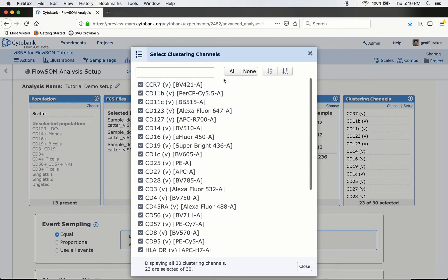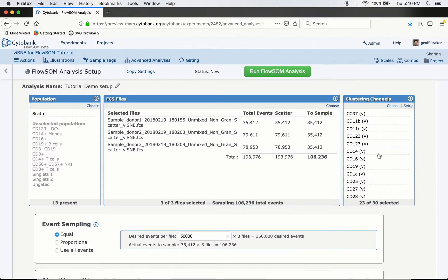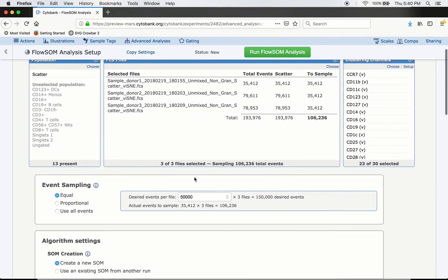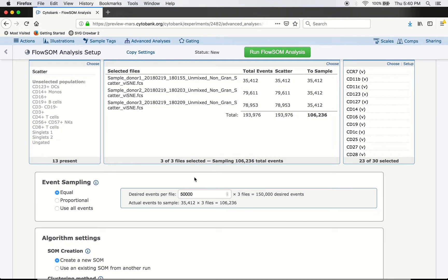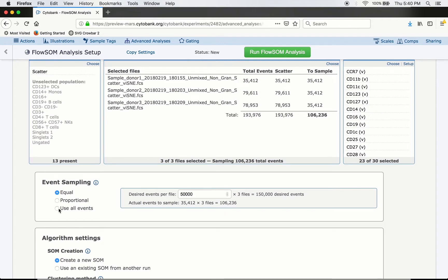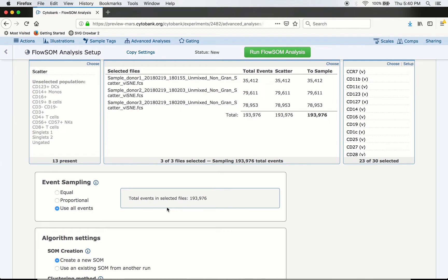The next option is Event Sampling — choosing how many events to include. The default is Equal Sampling, taking an even number from each file; here it selects 50,000 but since the smallest file only has 35,000 we take 35,000 from each. However, FlowSOM is so fast there won't be much difference using all events, so in this case I'll just say use all events.